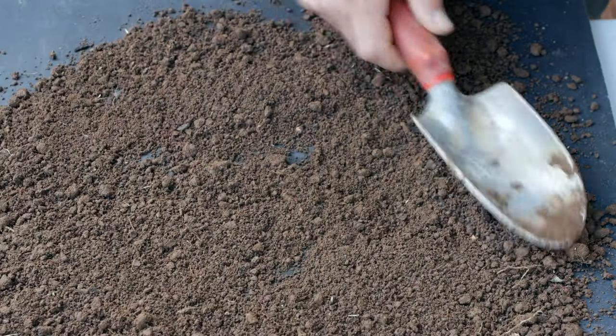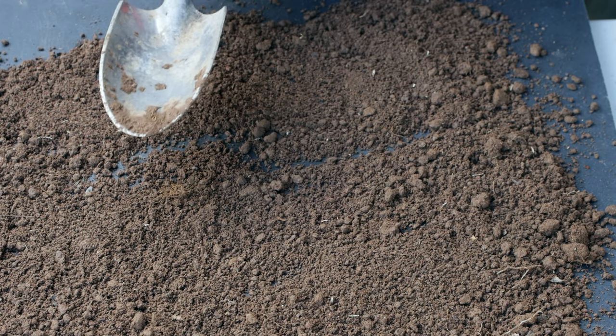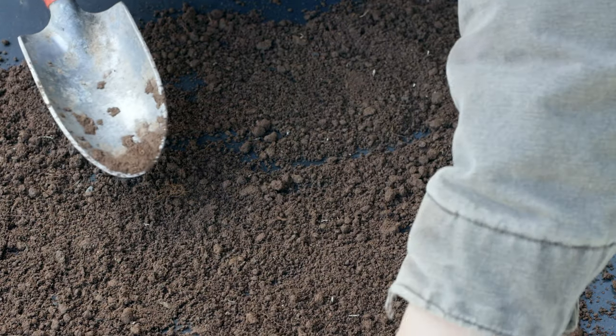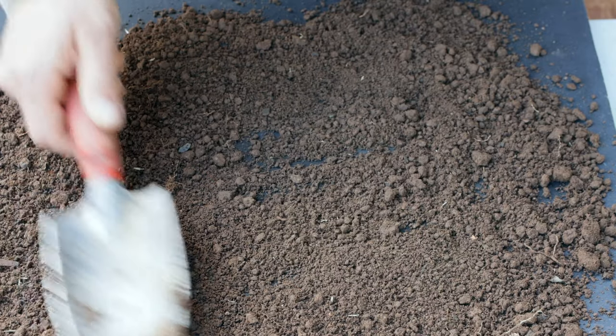I'm using a shovel to spread this out because I want to avoid touching the soil with my hands too much. I'll just pick out any big sticks and rocks — I don't see very many in this sample. Now I'll leave it here in the shade to dry for a couple of hours. It doesn't need to be completely dry, but it shouldn't be too wet.